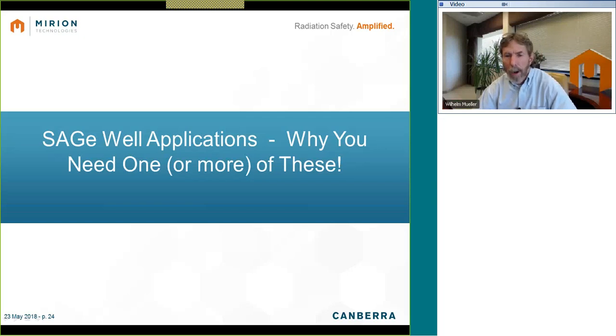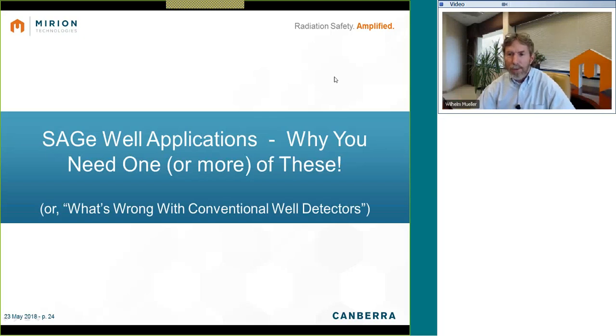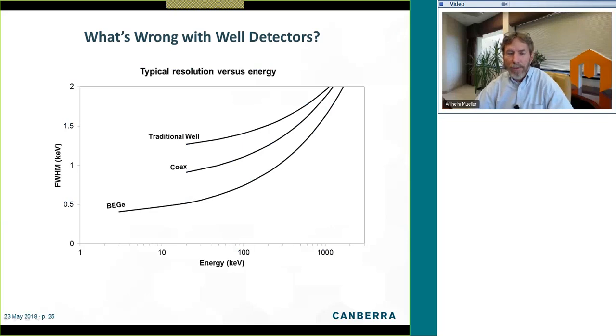Many of you may be aware that I had the privilege of being involved in the startup and equipping of radiochemistry labs in the past, and I'll tell you that I've never bought a well detector. Before you classify me as a hypocrite for not doing that, I actually would like to tell you why, because there is a reason for me not having bought a well detector. So perhaps the subtitle for this talk should be, what's wrong with conventional well detectors? And I'll start with this next slide to answer that question.